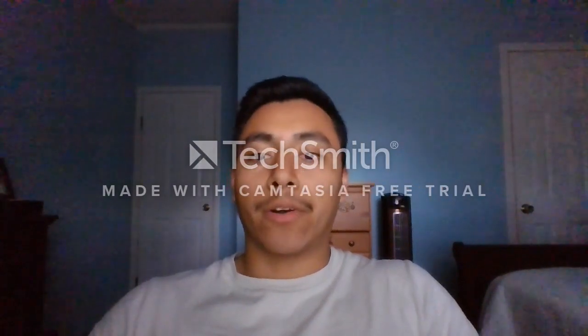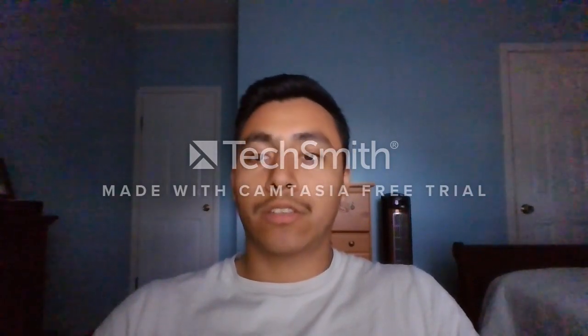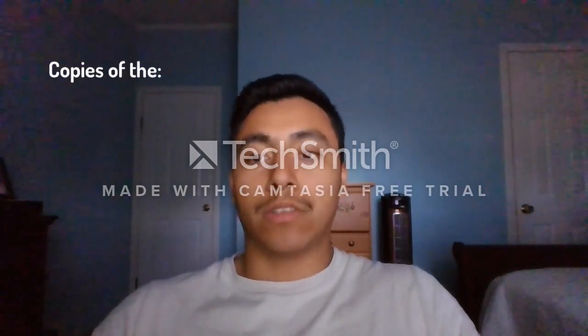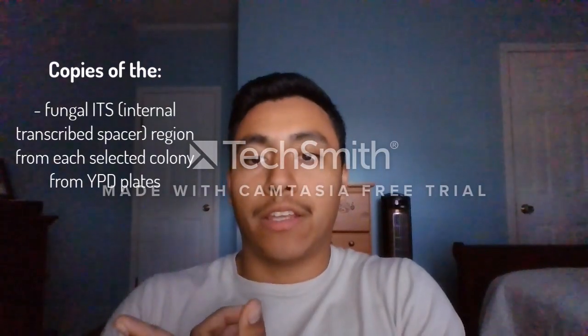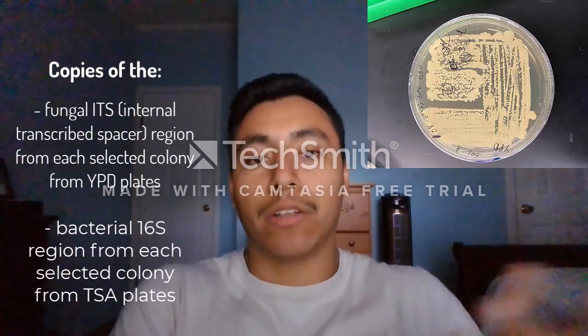Now, on our colony PCR 1, we selected colonies of interest from week 2 starter streaks to make many copies of the fungal ITS, which is the internal transcribed spacer region, from each selected colony from YPD plates, and the bacterial 16S region from each selected colony from TSA plates.